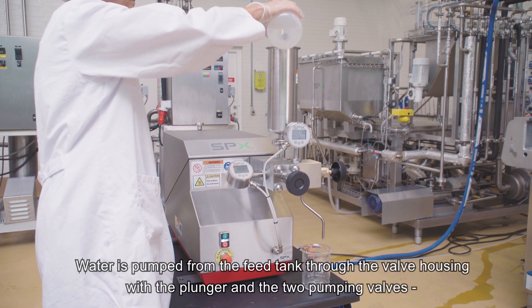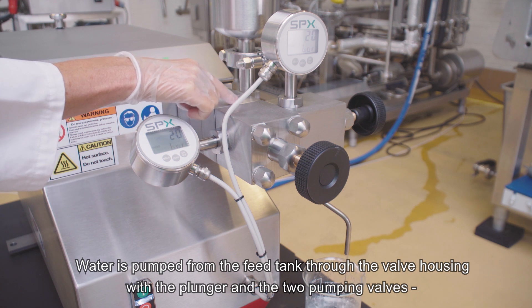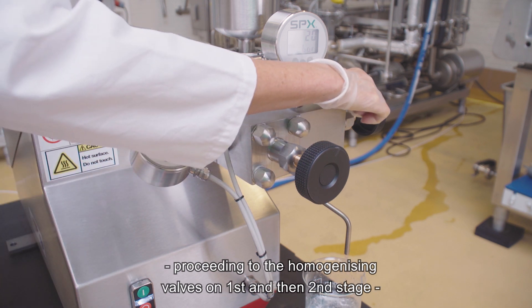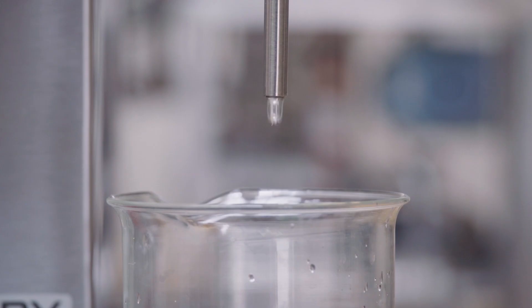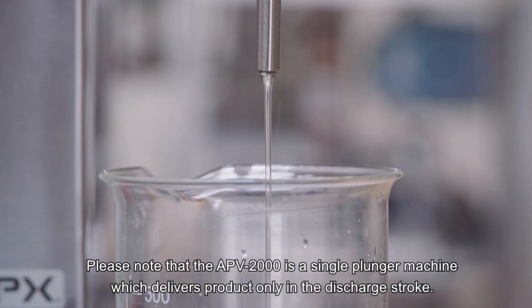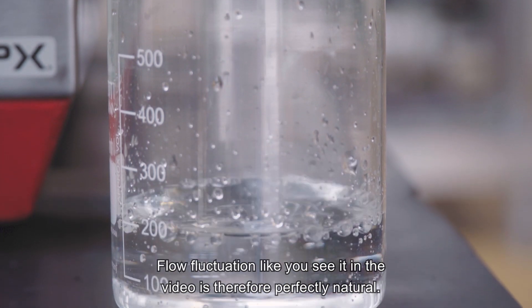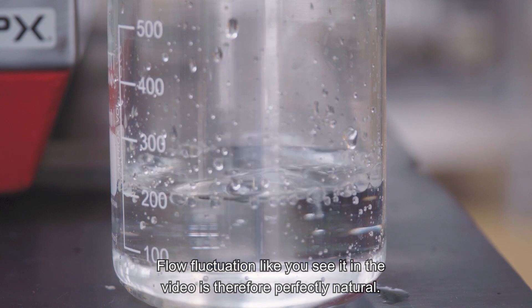Water is pumped from the feed tank through the valve housing with the plunger and the two pumping valves, proceeding to the homogenizing valves on first and then second stage, and finally leaving the discharge tube. Please note that the APV2000 is a single plunger machine which delivers product only in the discharge stroke. Flow fluctuation like you see it in the video is therefore perfectly natural.